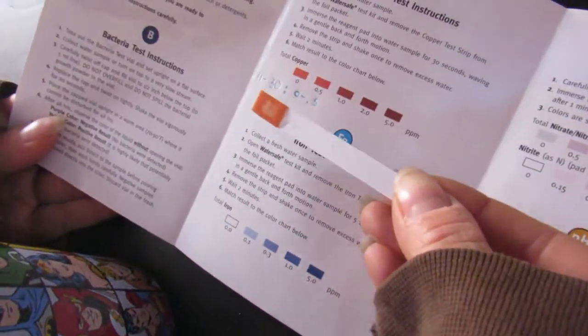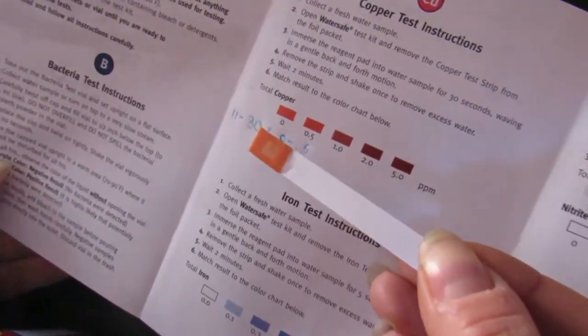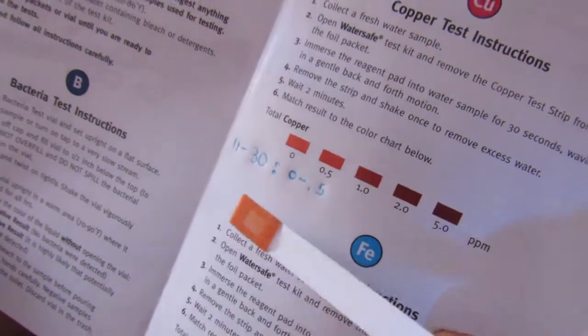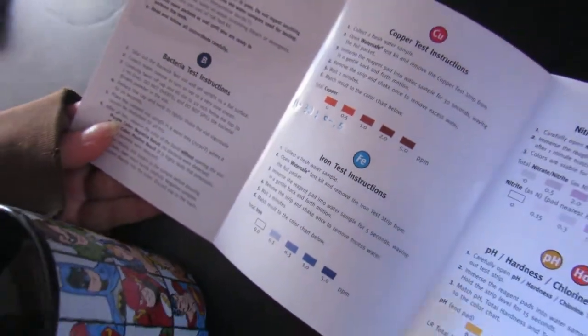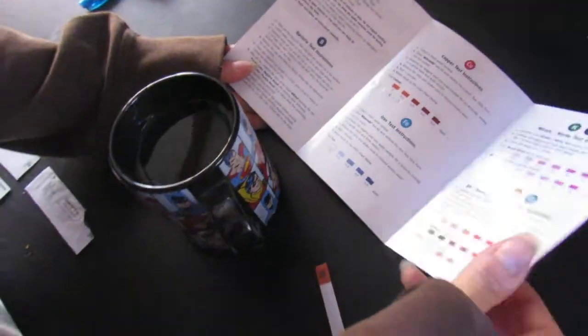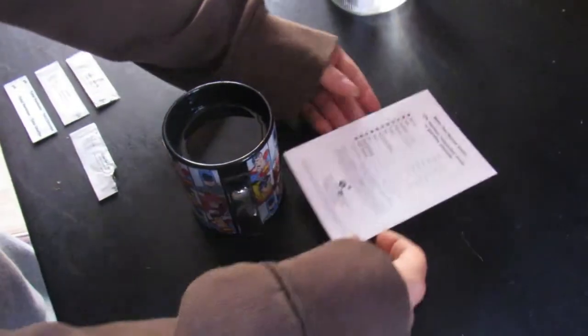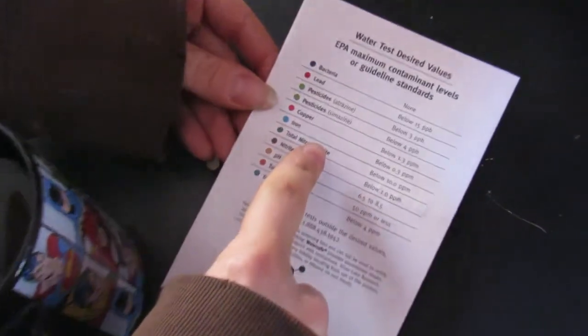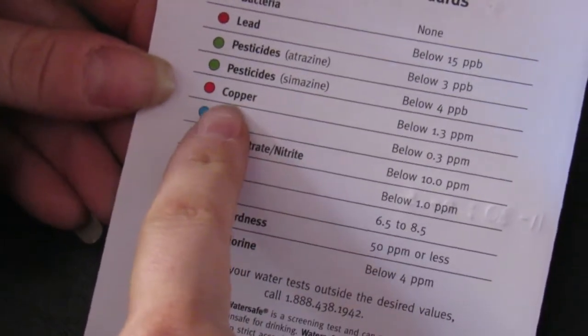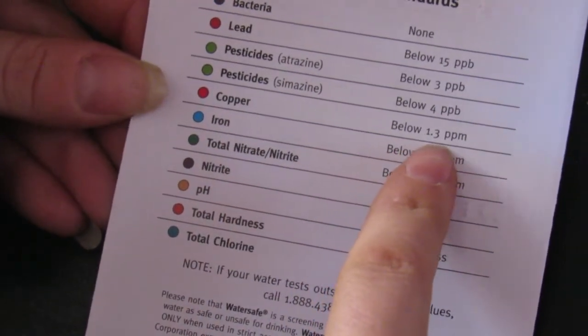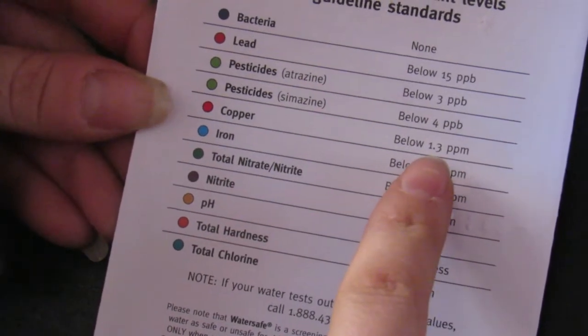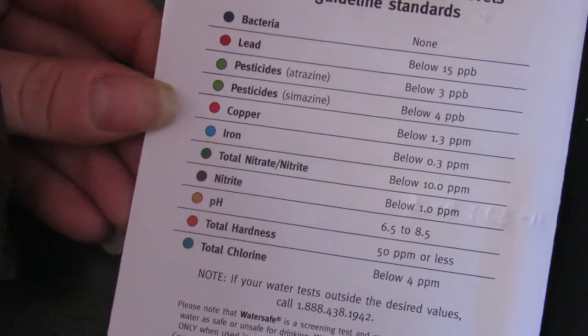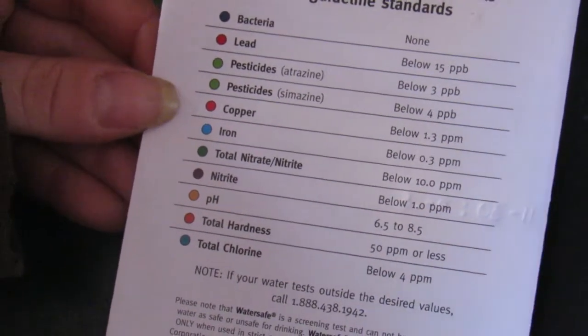Then you check it with the colors that they gave you. I already did this one. This one came out on the low end of the copper, which is between 0 and 0.5. I kept track of it so we can come back and do a test later. It tells you what the EPA maximum contaminant levels are. For copper, below 1.3 parts per million, so we're only 0 to 0.5. So we're fine on the copper range. We got one test done.